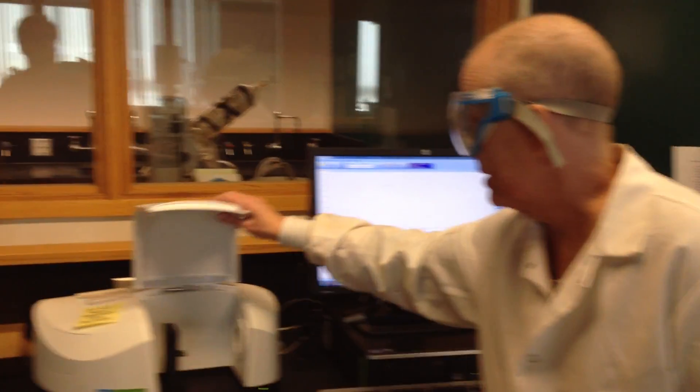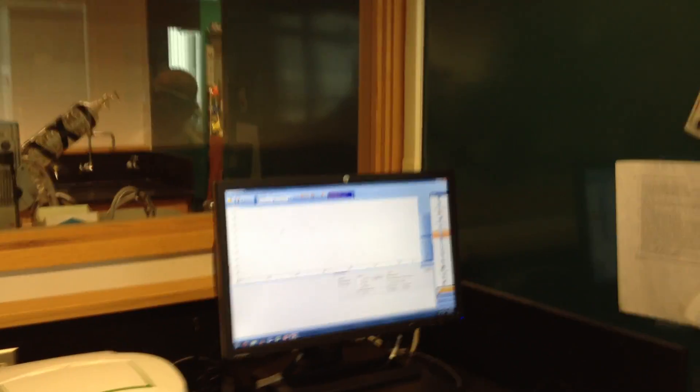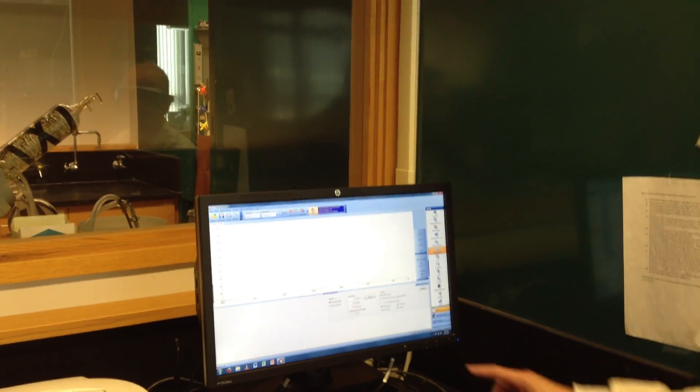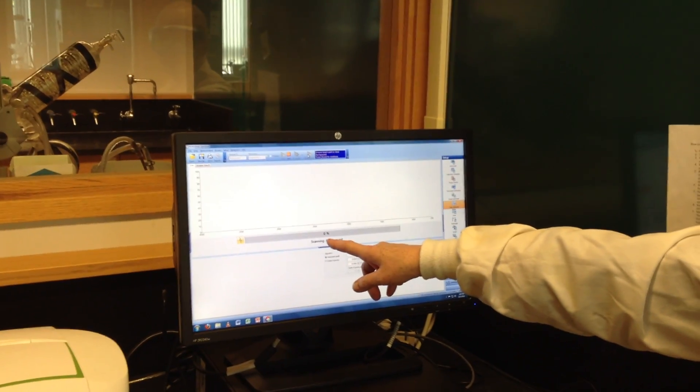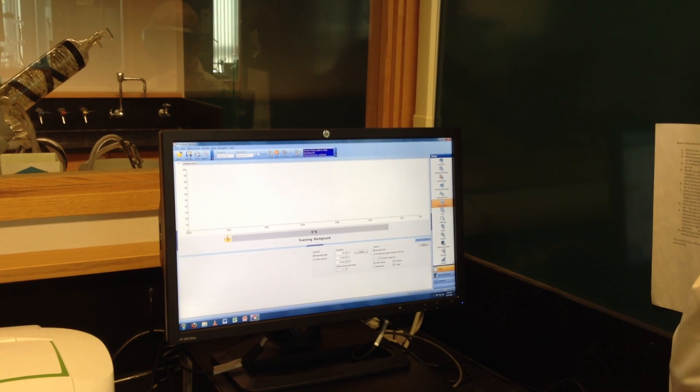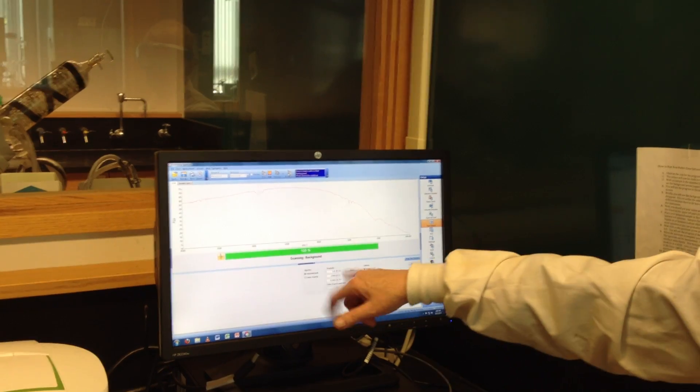We have to really keep our eye on this because it happens very quickly. I'm going to close the lid. This has a very friendly, user-friendly interface. I think you'll find when you use it, you can figure a lot of stuff out on your own. But I'm just going to run the background first. There's a little button up here that says background. Watch down here very carefully. It says background 0%. This turns completely green. I have to watch this. If I turn away for a second, I'm going to miss it. But it turns completely green when it's done. It says 100%. You'll see the spectrum up there. The spectrum flashes very quickly.